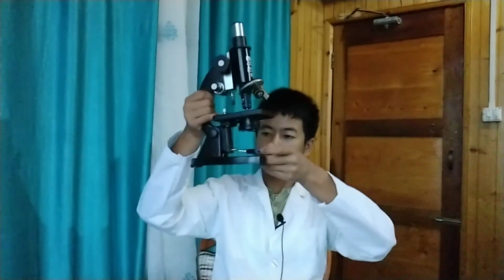And where the light is present, I just pull this mirror and the light gets onto the specimen and I can see it clearly.